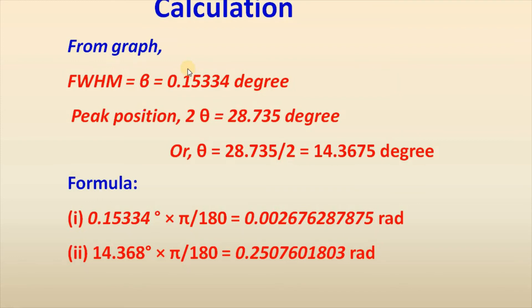Therefore, from graph, full width at half maxima which was equal to beta was 0.15334 degree for our sample and peak position twice theta was 28.735 degree or theta equal to 14.3675 degree. Now, in Scherrer equation, you need to convert the value of beta and theta in radians. In order to do that, you need to follow this formula.